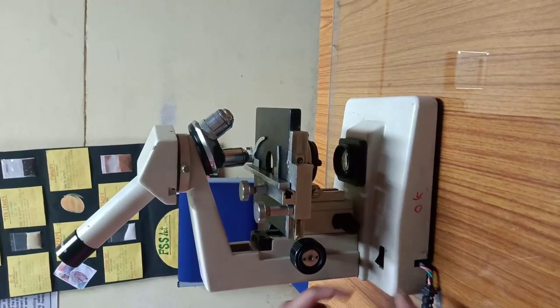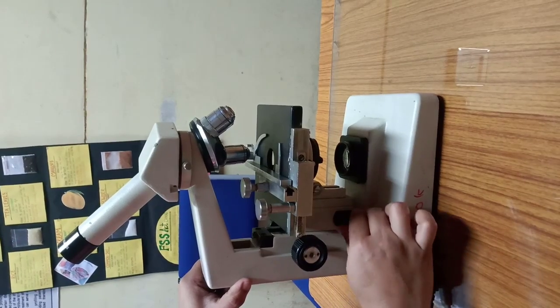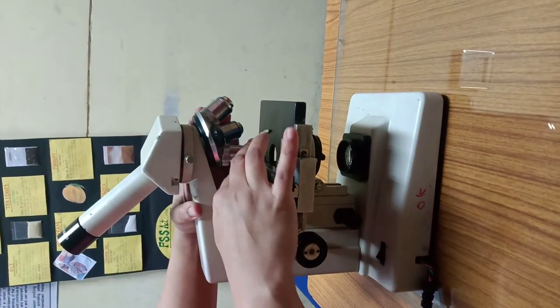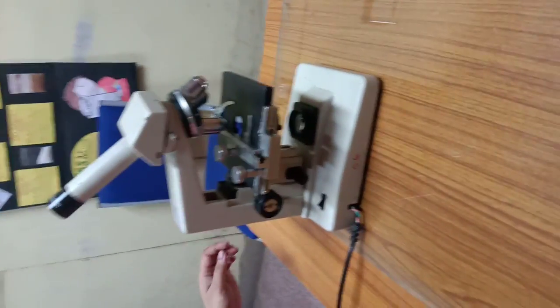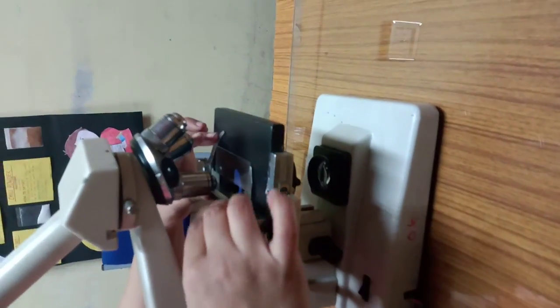Okay. Now here is a coarse adjustment knob and a fine adjustment knob. Coarse adjustment knob will alter the distance from the stage on which you place your slide. For example, let us take a clean slide and place it on the stage.